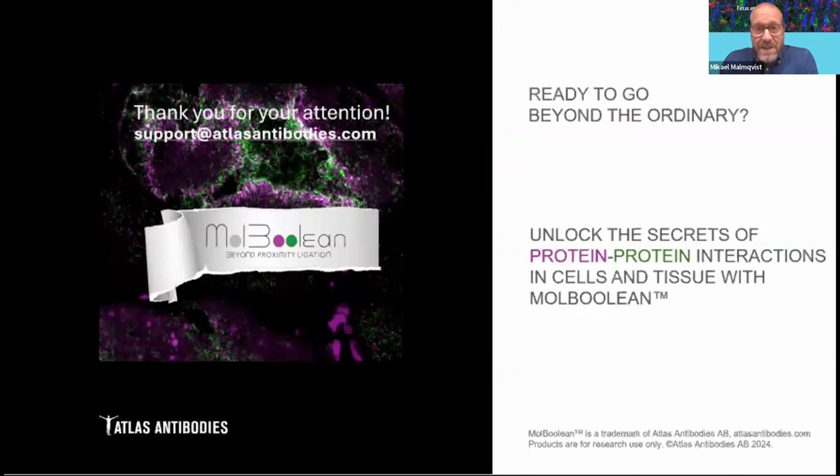Thank you for a wonderful presentation, Ola. You gave a seminar at Brock University a few years ago, and it is wonderful to see how you have advanced the technology for protein-protein interactions. We commonly employ Atlas Antibodies in our work and have successfully employed them in studying Notch transcriptional condensates. My question is whether you have insights into the efficacy of the MolBoolean approach in the context of phase-separated protein assemblies. We have, for example, observed differences in antibody accessibility. Thanks and all the best, Sasha.